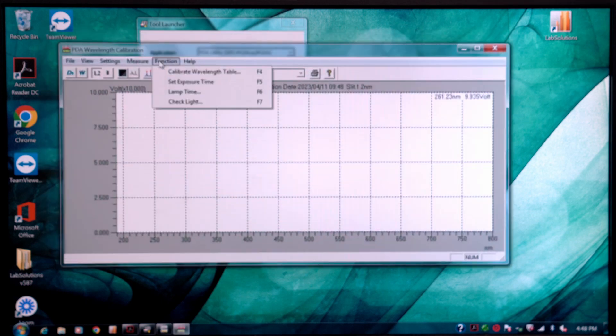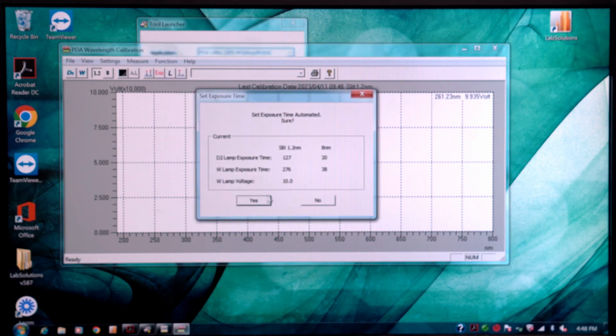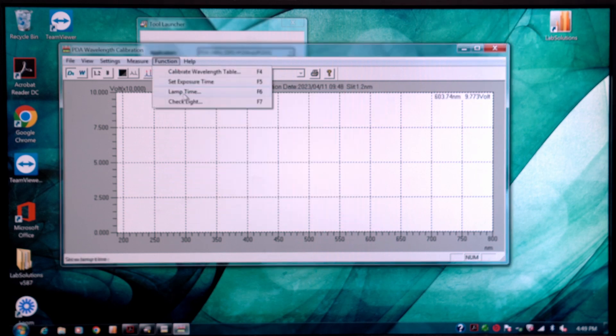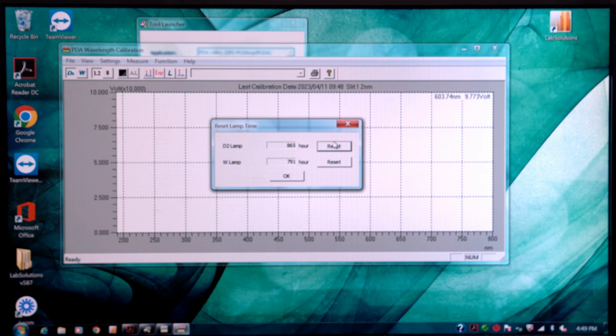And then you have to go Function and go to Lamp Time and reset the lamp hours because it's a brand new lamp.